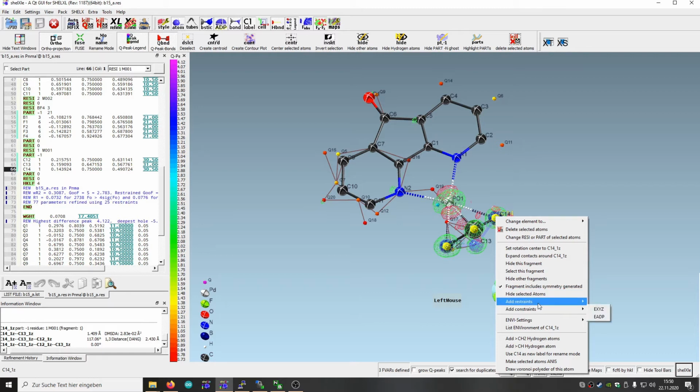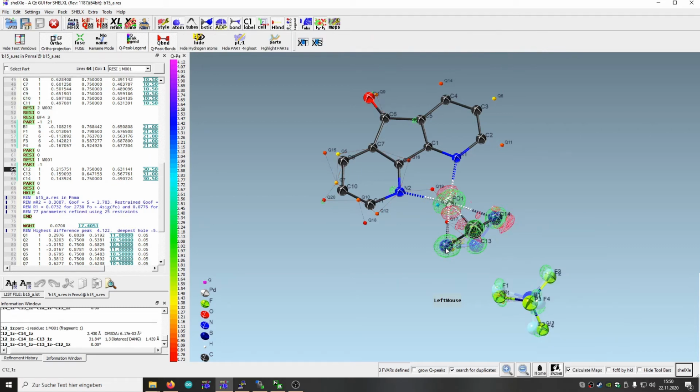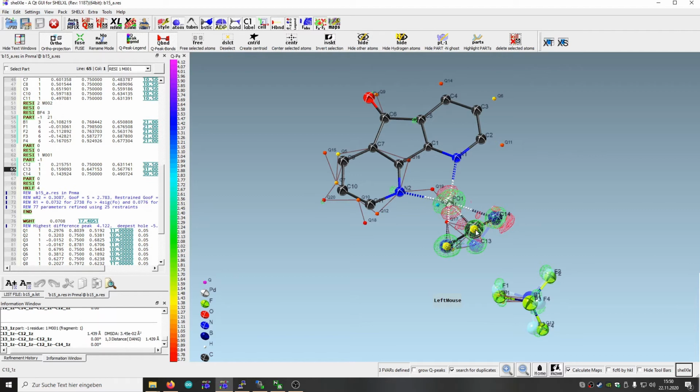So we add a restraint, probably just like this first.